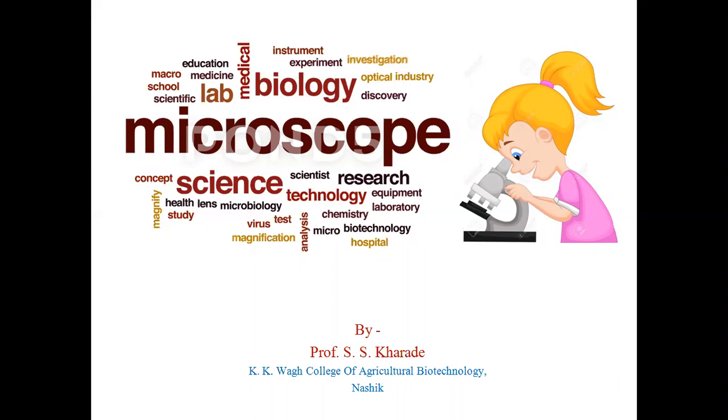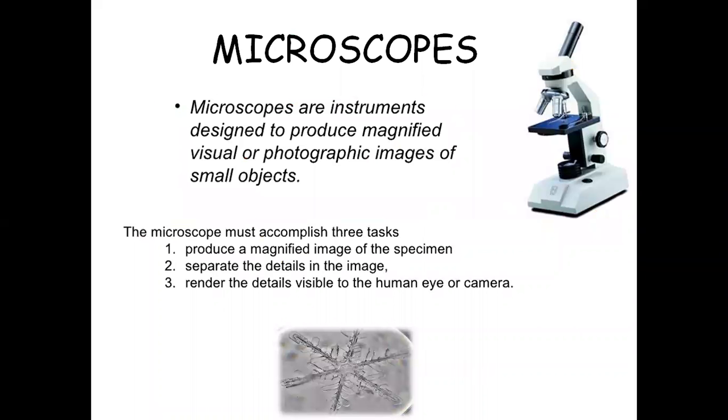Now going to deliver a topic on microscope. So the basic definition of microscope is, microscopes are instruments designed to produce magnified visual or photographic images of small objects.